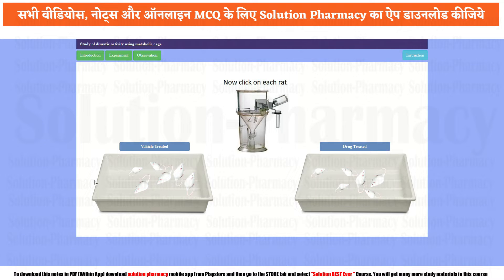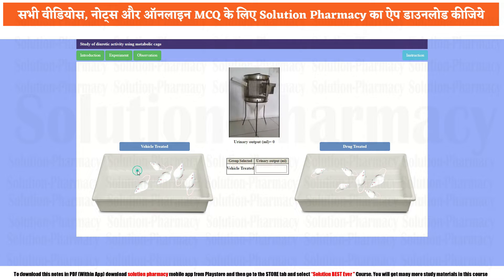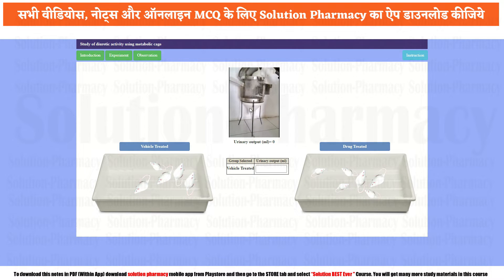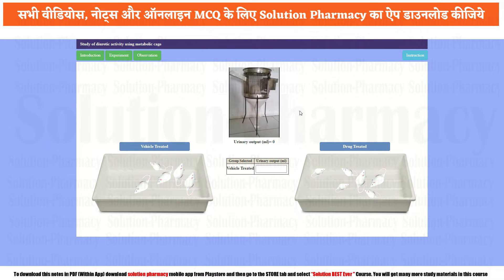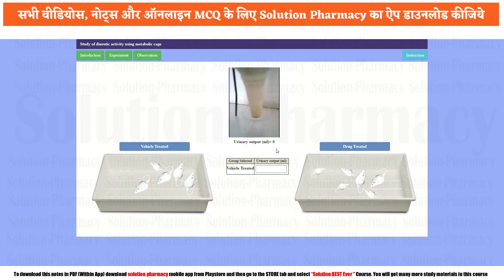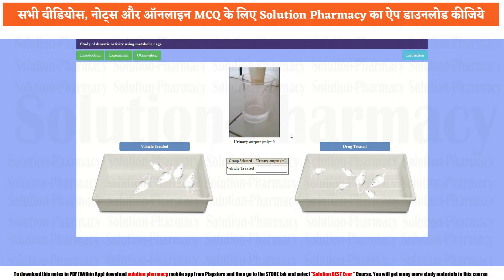Now click one rat at a time and note the response. Start with the vehicle treated group — click on one rat. The rat is placed on a small cage-like instrument with a separate beaker beneath it to collect urine. After 5 hours, measure the volume of urine. In the vehicle treated group, it is found to be 3.2 ml. Note it down and repeat the same with all animals in this group.